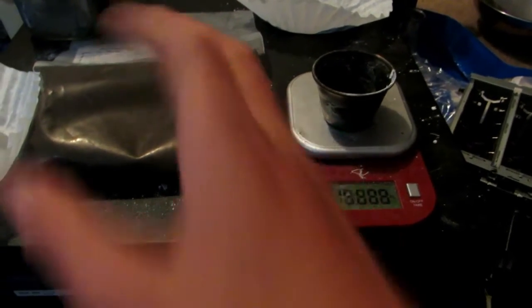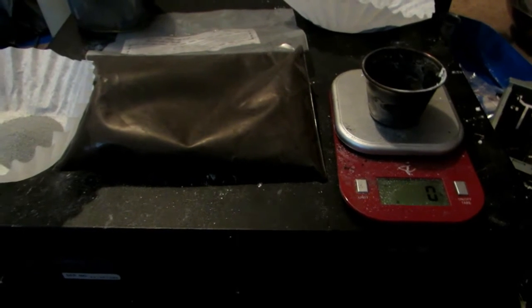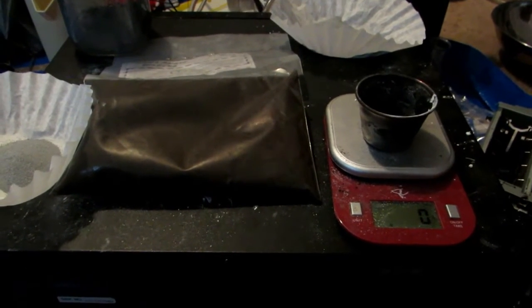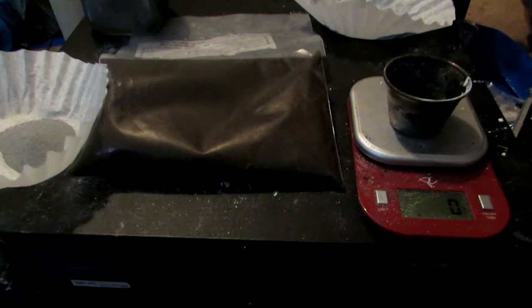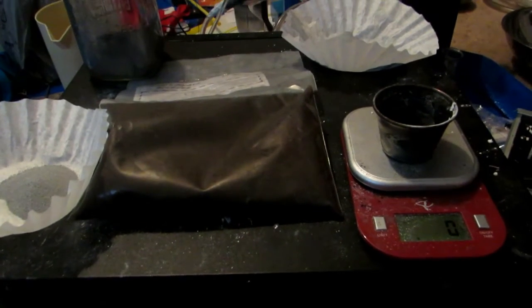We'll weigh out 50 grams of manganese dioxide powder. Next, we will go outside and mix them together very, very well in a blender — this can be a coffee grinder or anything just to get them mixed really well. Alternatively you could use a spoon, however I find a blender much better at mixing things.